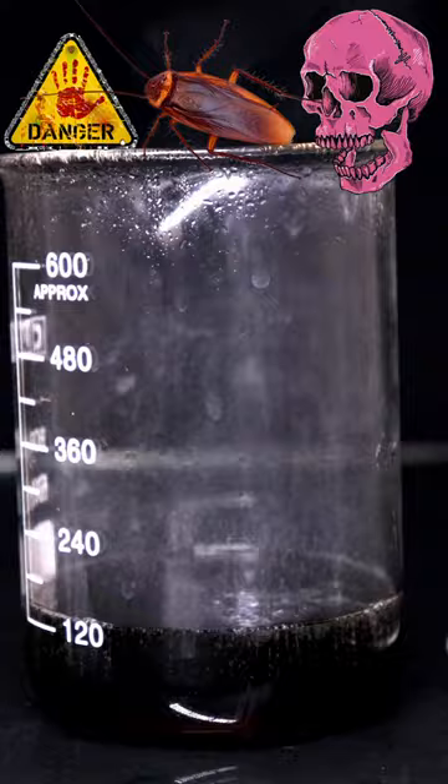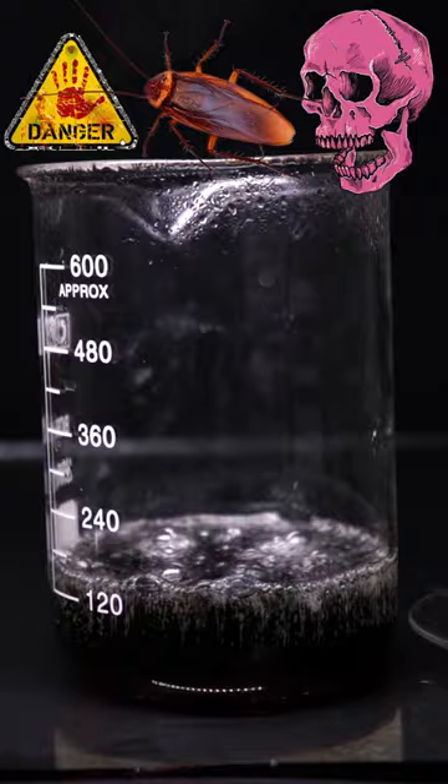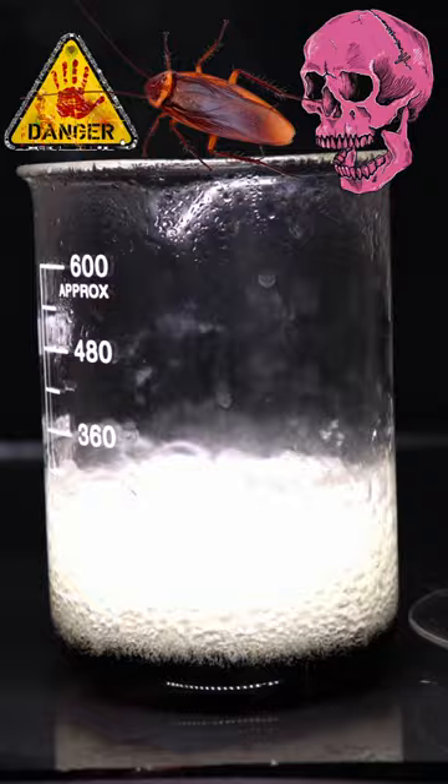We kept adding hydrogen peroxide to this mixture and the reaction gets more violent. After a while the cockroach completely dissolved and the piranha solution returned clear, like nothing happened here.